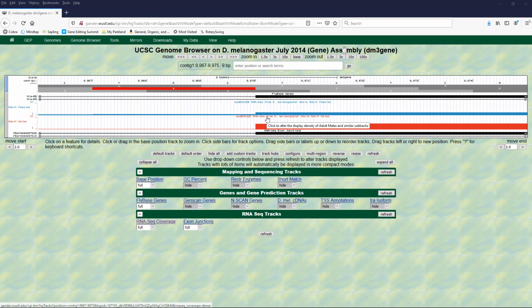And again, 13, this is a tough one. Notice that before our reading frame was the bottom of these 3 reading frames. But is it still the bottom? Or are we in a different reading frame now that we have begun exon 2? So for question 13, I want you to tell me which of these 3 reading frames is the correct reading frame for exon 2. Is it the top one, the middle one, or the bottom one?